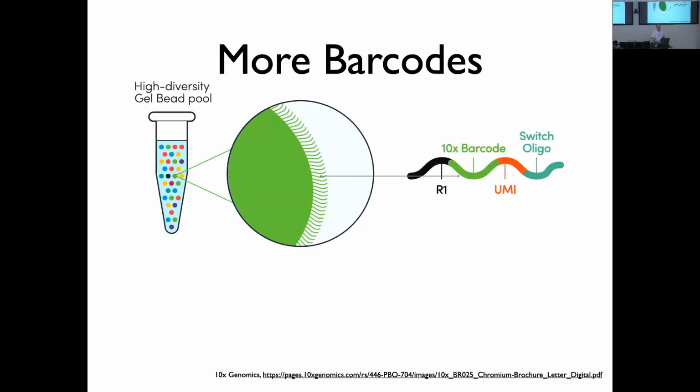So you might see 1,000 different transcripts from glucose 6-phosphate dehydrogenase in a given cell. The UMI lets you uniquely distinguish: okay, I've sequenced this and I know it's from gene A, glucose 6-phosphate dehydrogenase. Is this actually from a different RNA molecule? I see this 1,000 times. Is each of those from a different RNA molecule, or am I actually seeing PCR replicates? In the library prep, we're doing PCR. Did it just get amplified during the library prep? Because if it's from unique RNA molecules, I want to count those separately.